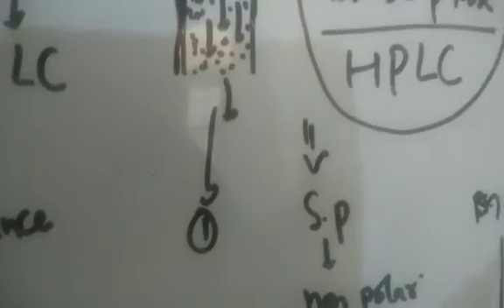We get beautiful peaks, and the number of peaks will give us the number of compounds, and then we use the time scale. That will give us an idea about the polarity of the compounds. So this way we can check the components in our sample in a fast way. So we should say that HPLC is an automated form. HPLC is a highly automated and extremely sensitive technique.